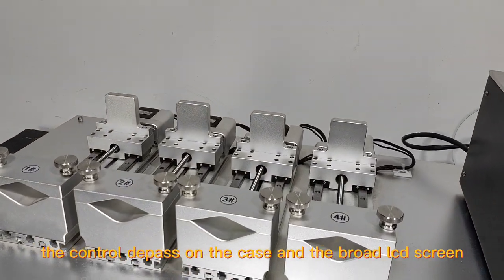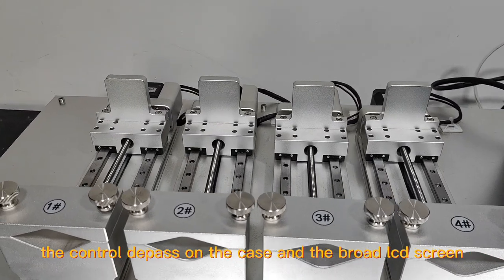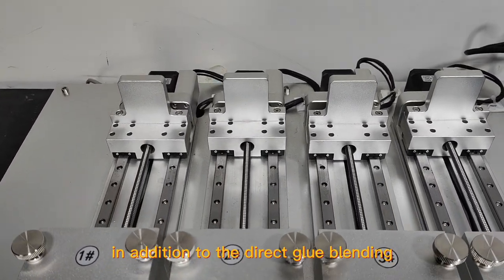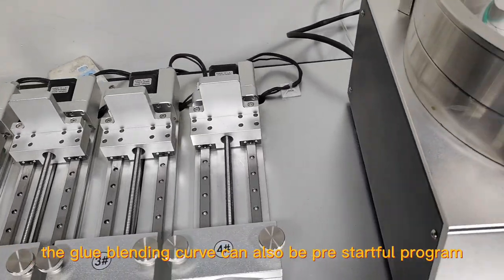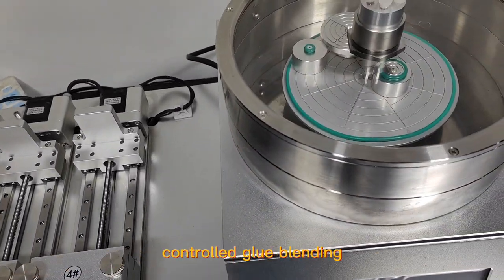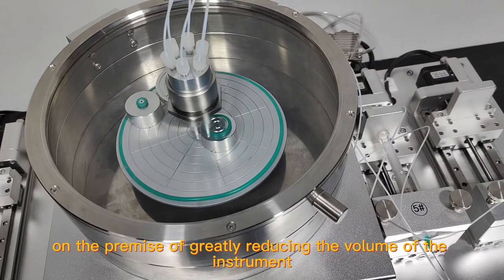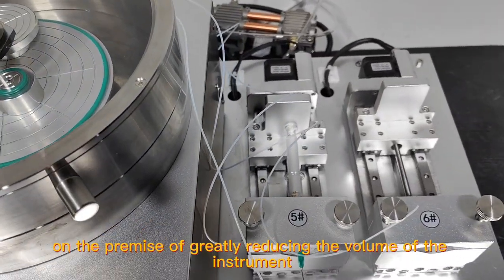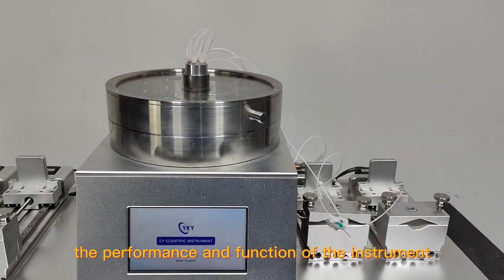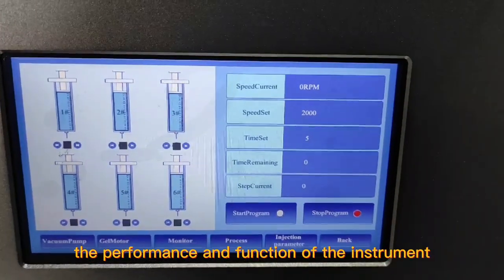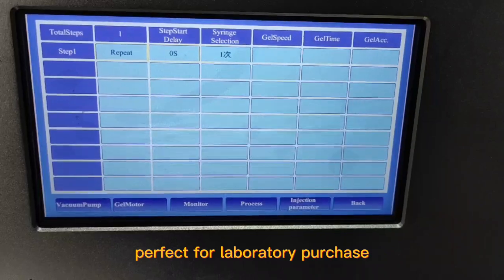The control depends on the case and the bright LCD screen. In addition to direct glue blending, the glue blending curve can also be pre-stored for program-controlled glue blending, on the premise of greatly reducing the volume of the instrument. It effectively guarantees the performance and function of the instrument. Perfect for laboratory purchase.